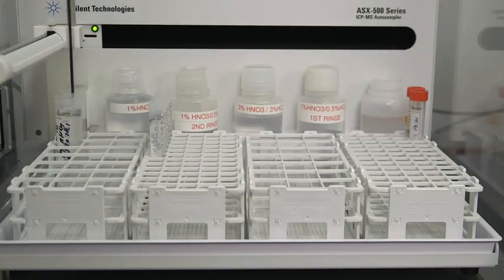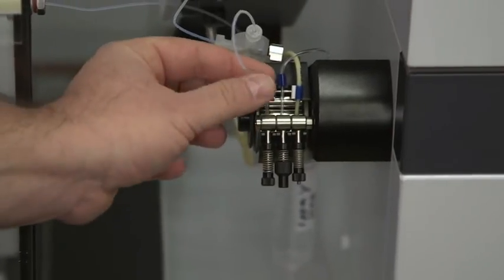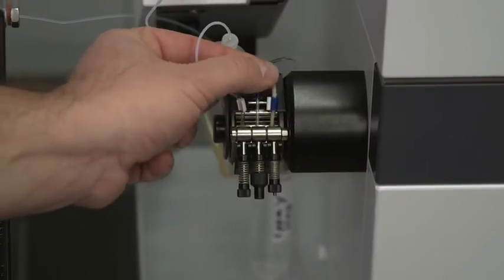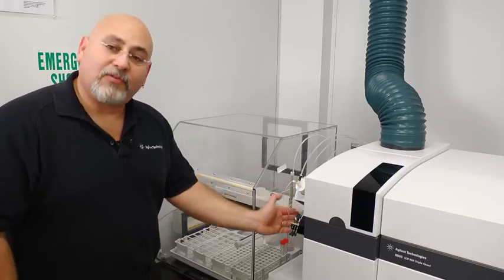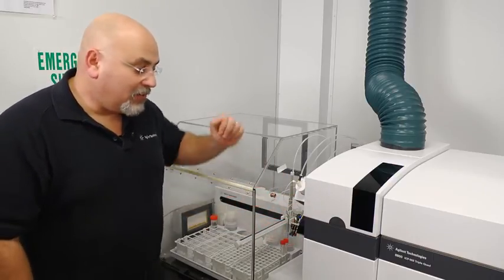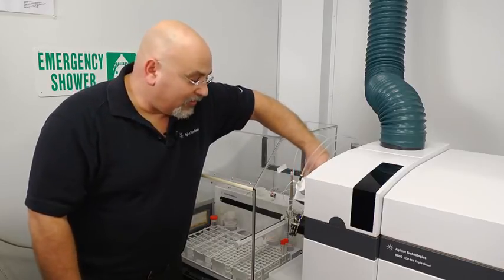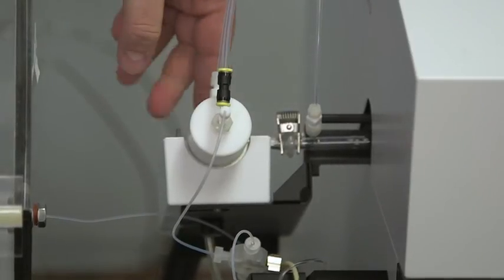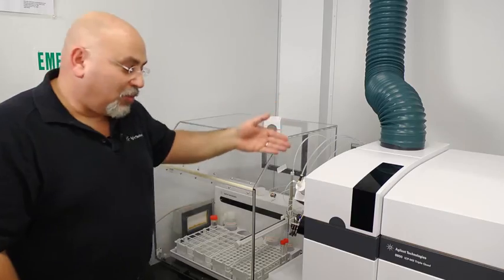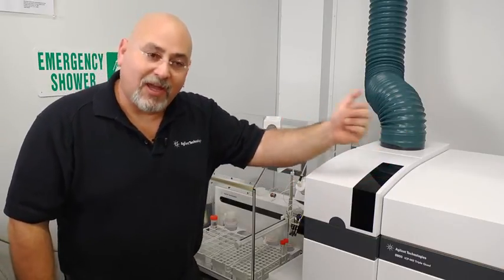Samples are typically in an autosampler, which goes through the samples they're taking for analysis. We are using a 3-position peristaltic pump. The first position is for the sample uptake. The second position is for the internal standard, while the third position is for evacuation of the actual waste. The sample is then carried through a nebulizer. This is a concentric nebulizer, a low-flow concentric nebulizer, which nebulizes the sample into a Scott double pass spray chamber. The small droplets are then carried into the torch and eventually ionized in the plasma.